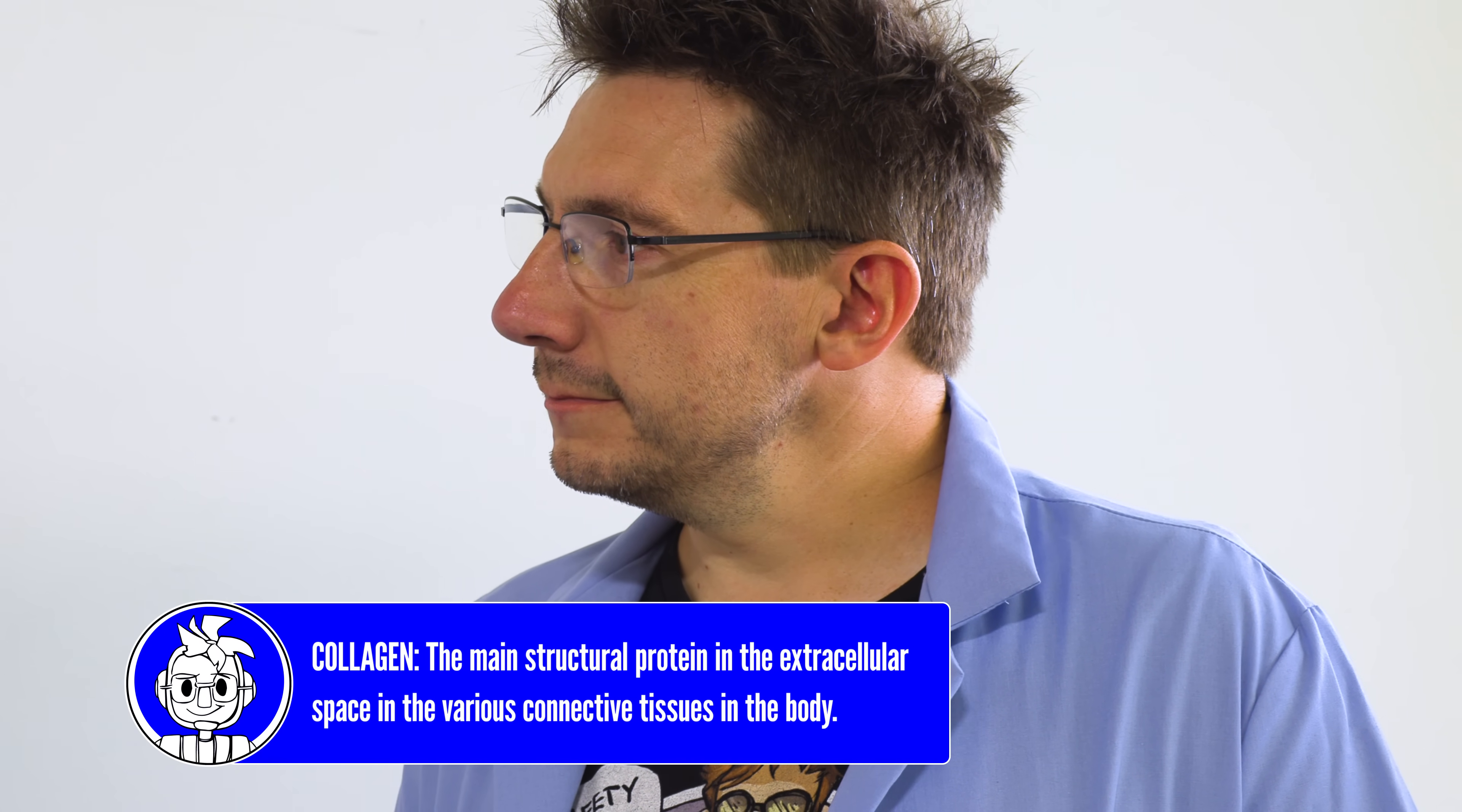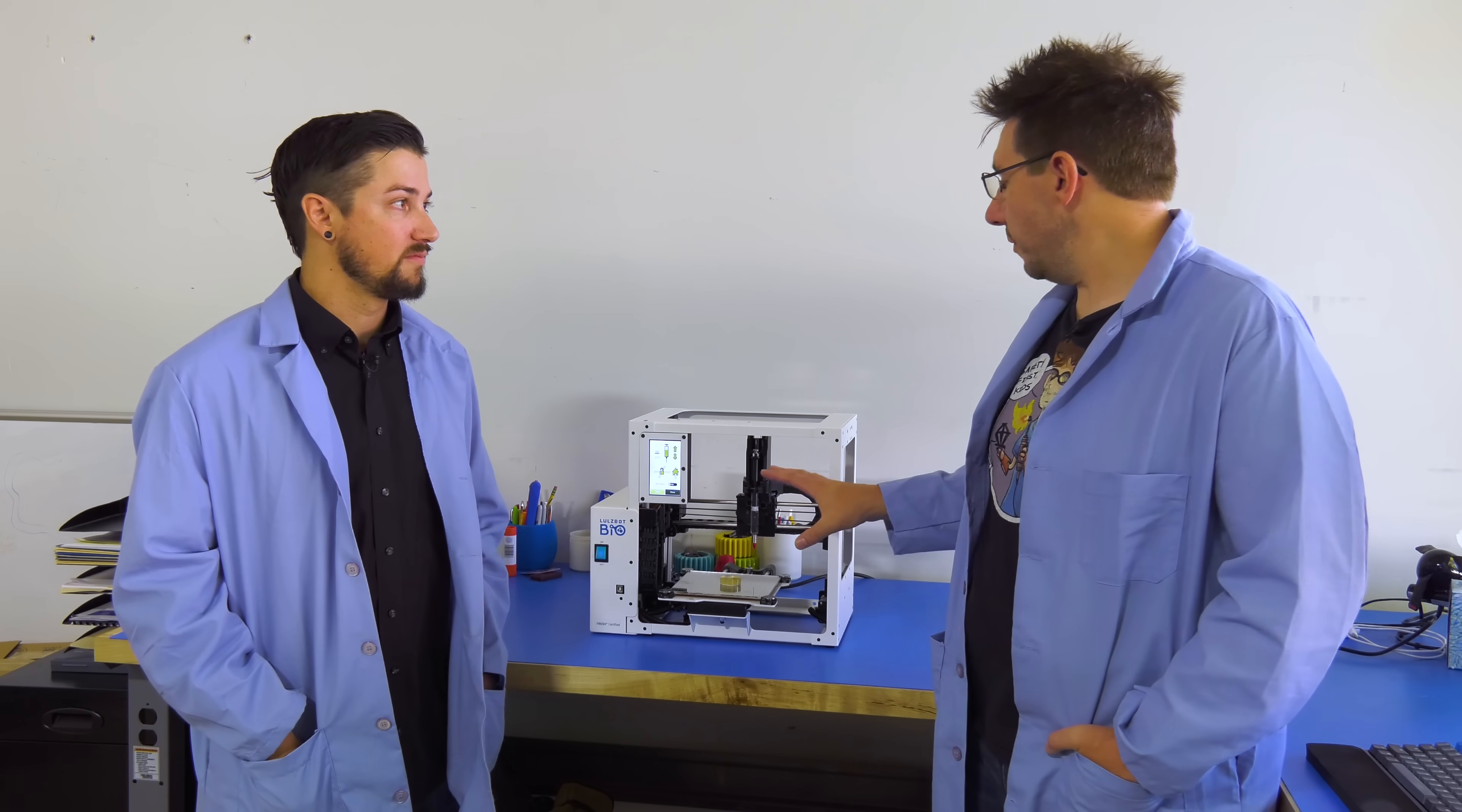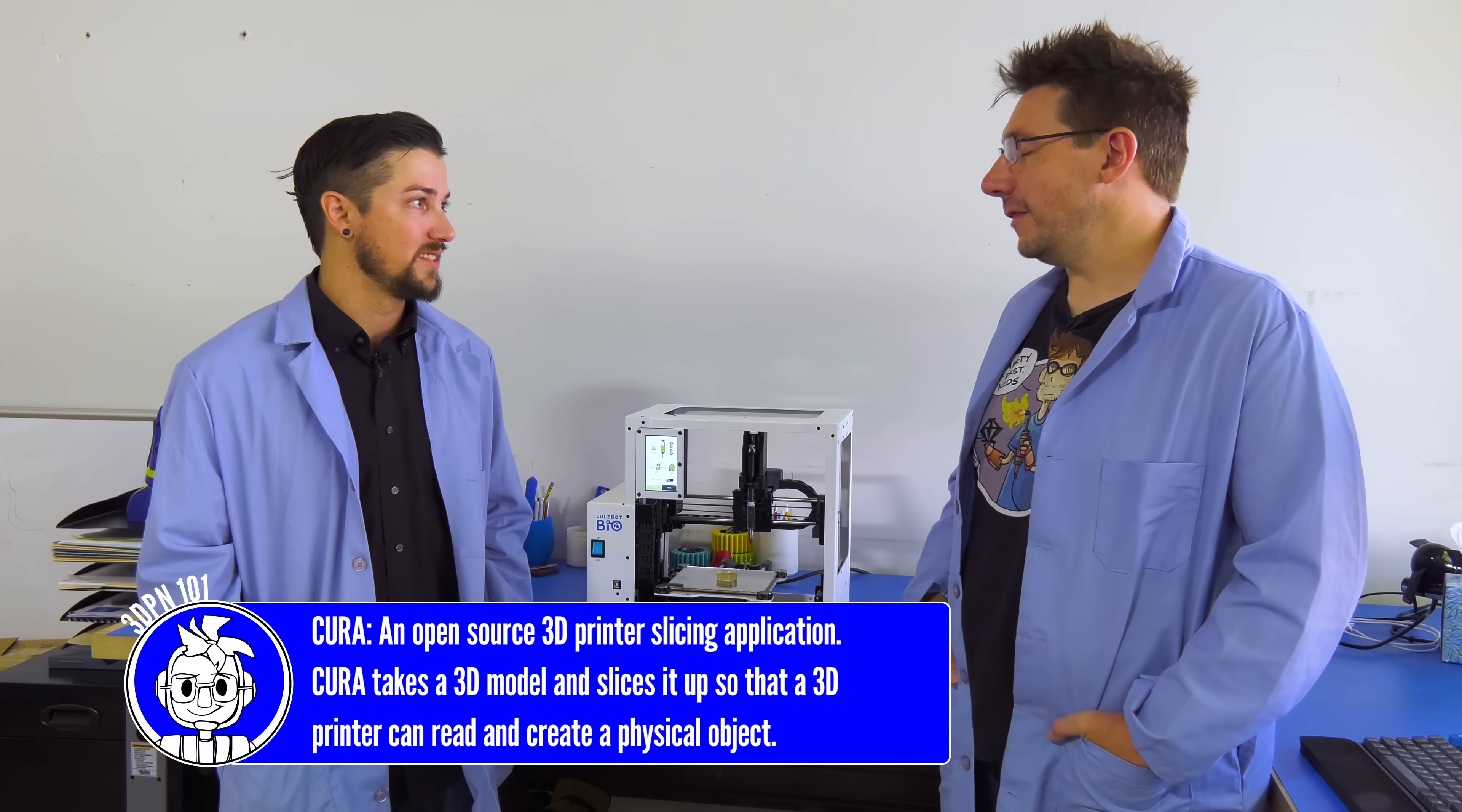So we have done collagen. Alginate is a brown seaweed-derived material for prototyping, but really the sky's the limit in terms of you can do photocurable resins, epoxies, silicones. Those will not be preset profiles out of the box, but we will eventually get there. Profiles out of the box. So this platform, this Lulzbot Bio, is actually using Lulzbot Cura? Yes. We use Cura Lulzbot Edition, and as always, it's free software and open source hardware. That's so cool.